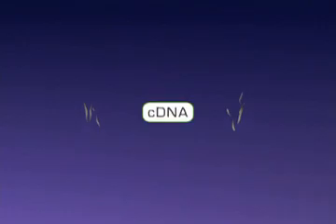The mRNA is then reverse transcribed into more stable complementary DNA, called cDNA.